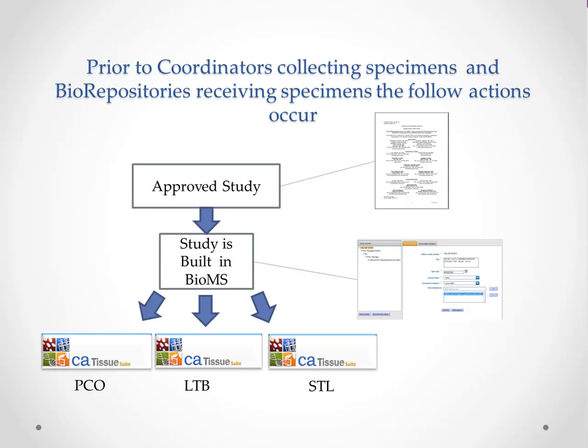Once a study is approved by the protocol office, the study is built in BioMS. At the completion of the study being built, information about the specimens collected is synced to the biorepositories through caTissue.